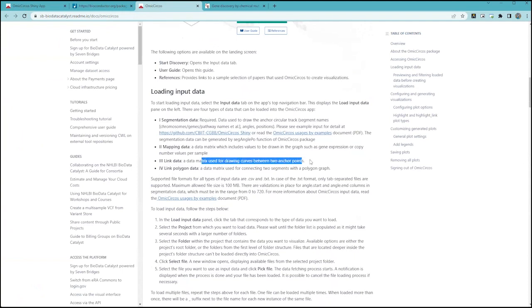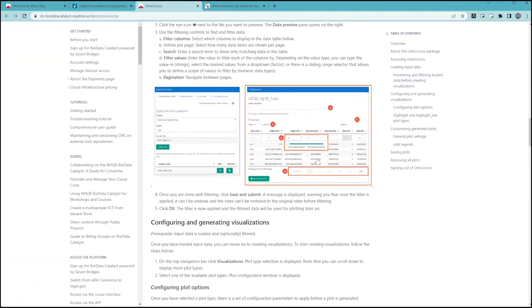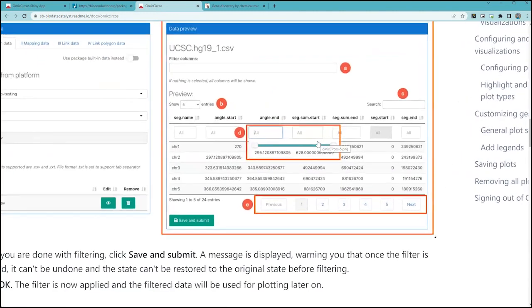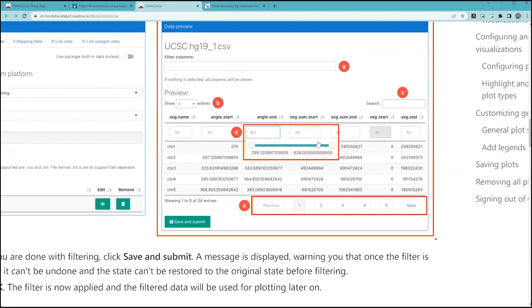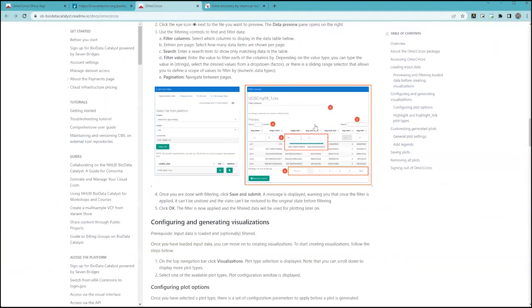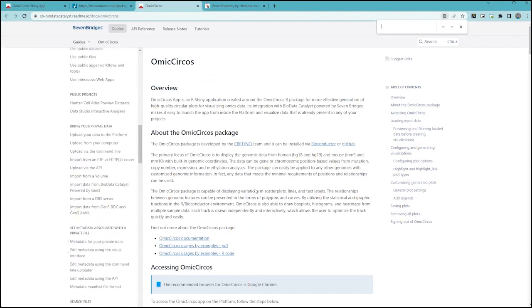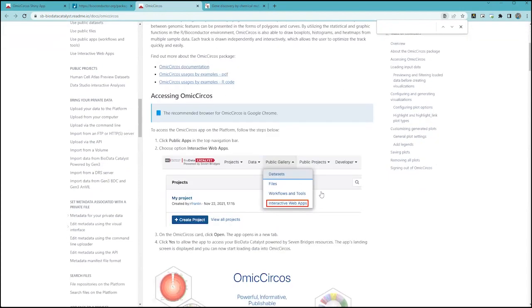Two more questions to piggyback on that one. I see that at least in the example that you showed, or like the code that you just showed, it was HG19. Any idea if this is restrained to HG19 build only, or can this also work with HG38? Or is there any such concern that it will not work with any other genomic build for that matter?